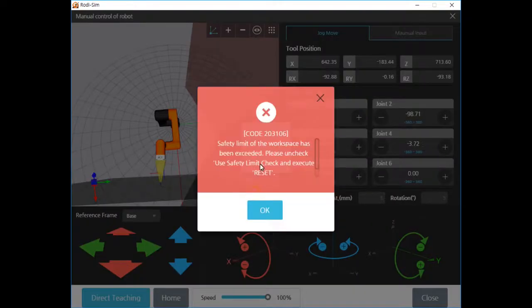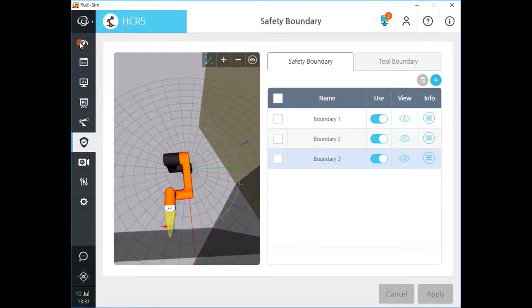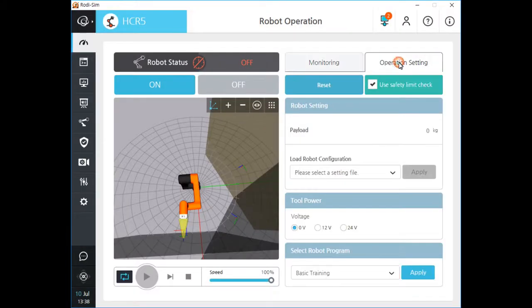You cannot move your robot anymore because the safety system turns off your robot arm automatically and repeatedly. So, there is a description for operators. Please read the message on the screen and follow the steps to move your robot inside the safety boundaries.